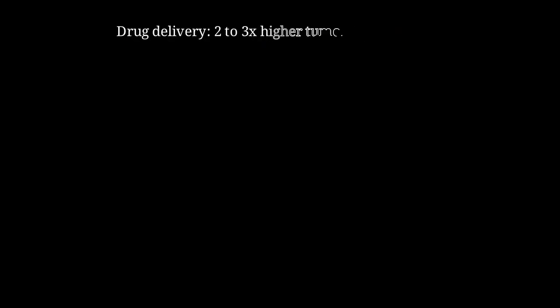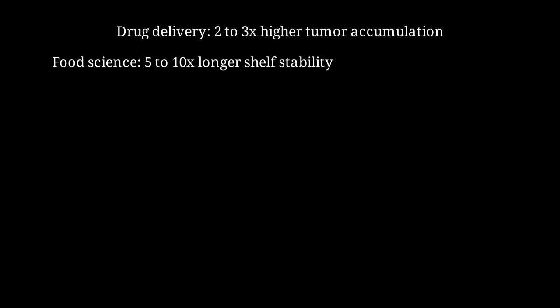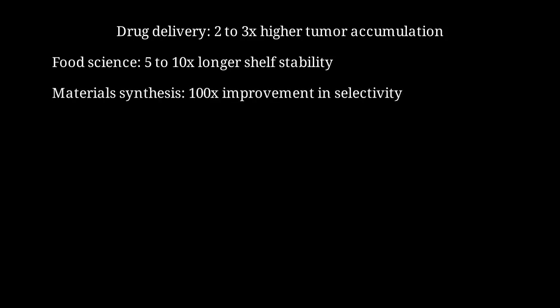Let me quantify the benefits of microfluidic emulsions compared to traditional methods across our 3 application areas. In drug delivery, microfluidic monodisperse formulations show 2 to 3-fold higher tumor accumulation compared to polydisperse conventional formulations. In food science, monodisperse emulsions show 5 to 10 times longer shelf stability against coalescence and creaming compared to conventional emulsions. In materials synthesis, monodisperse pore structures can show up to 100-fold improvement in selectivity for size-dependent separations or reactions.